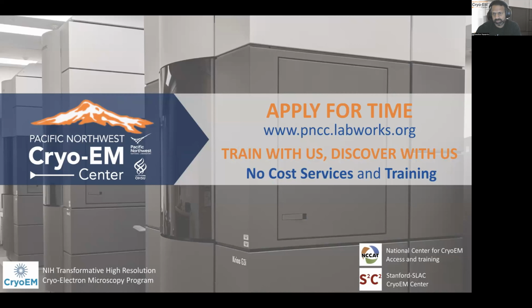In both cases, approved proposals are assigned a scientific point of contact, a SPOC, basically me, or a microscopist like me, who can help you with questions about sample optimization, data collection strategies, and so on.